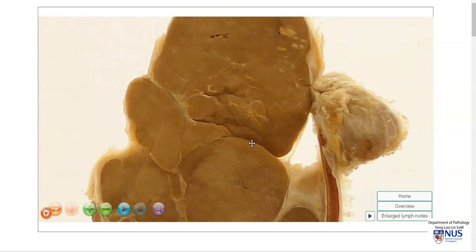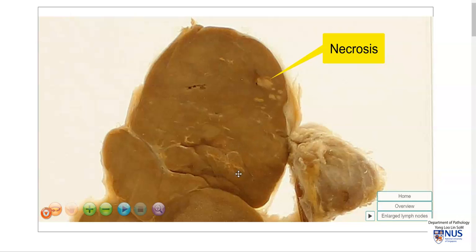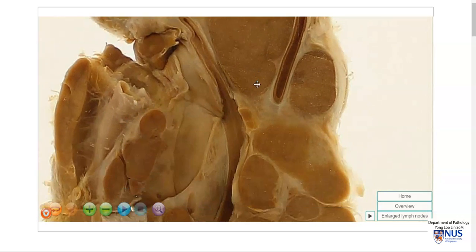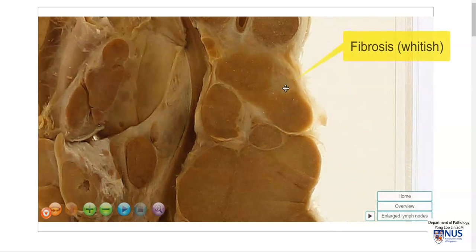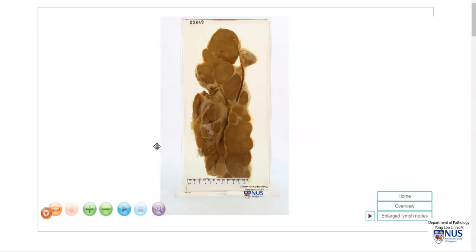Looking at different areas on the cut surface, we can see some paler areas here which may represent necrosis, although in most areas we don't see obvious necrosis. This whitish area here may represent an area of fibrosis.